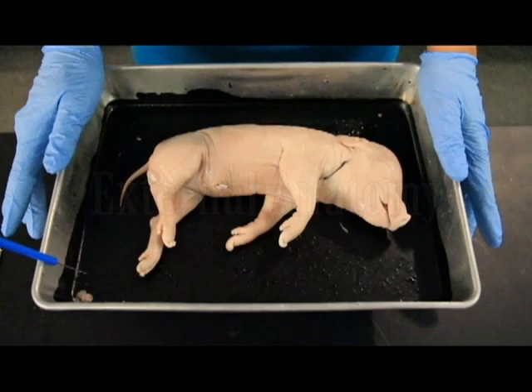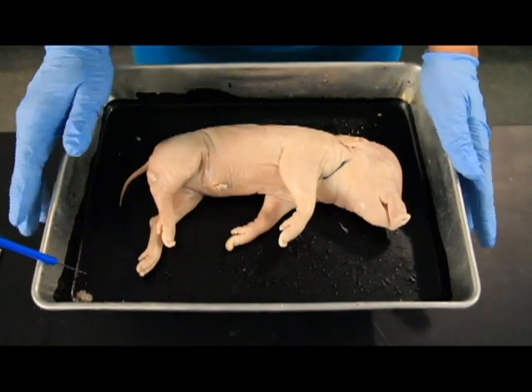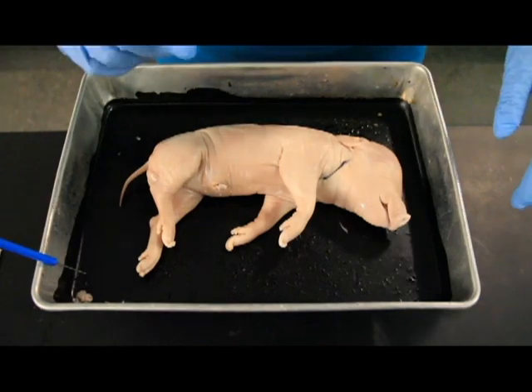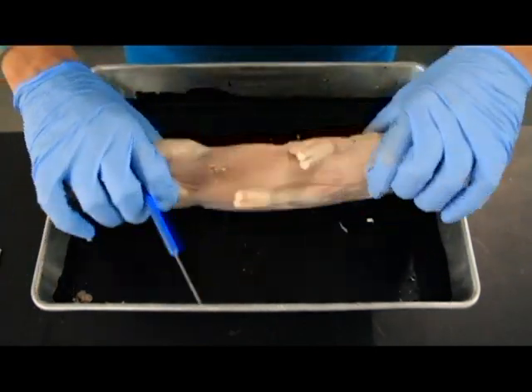So the first part we want to start with is determining whether our pig is a male or a female pig. Now you are responsible for both sexes. Doesn't matter if you get a male or a female, you are still responsible for the other sex. So the first thing we want to do is determine which sex it is.